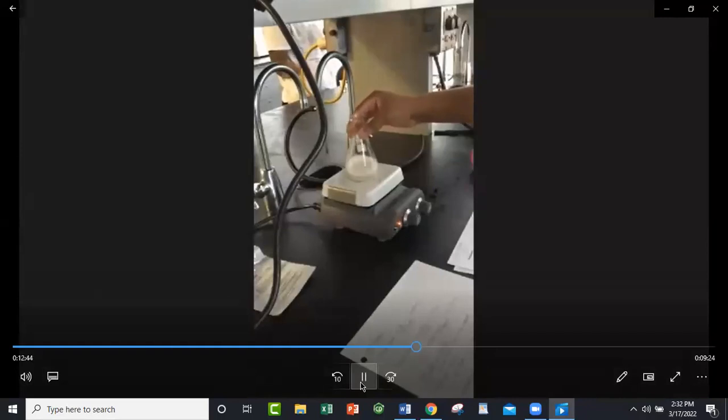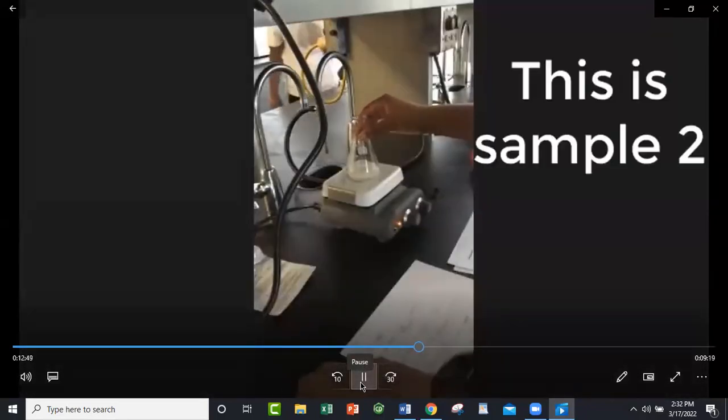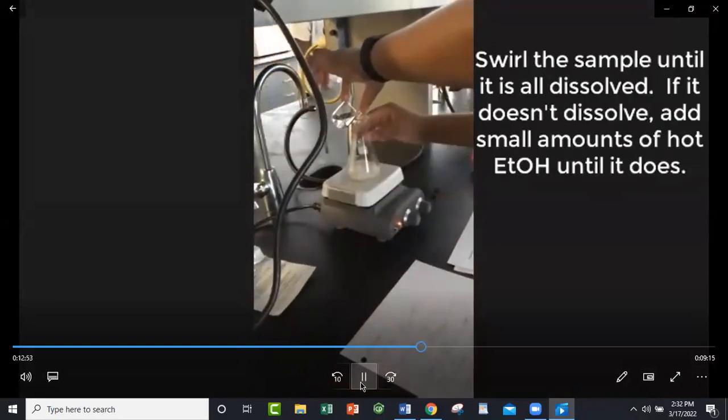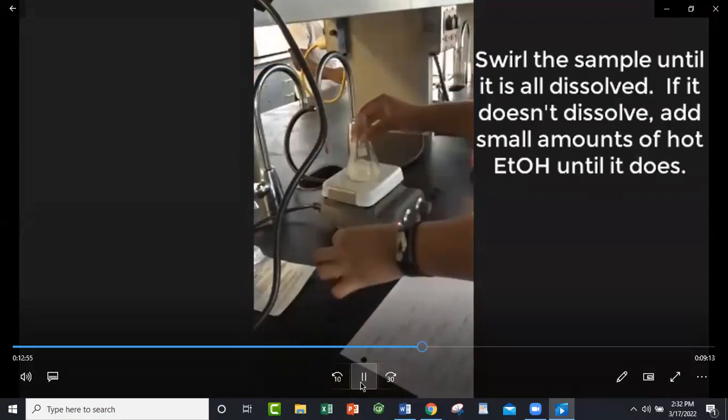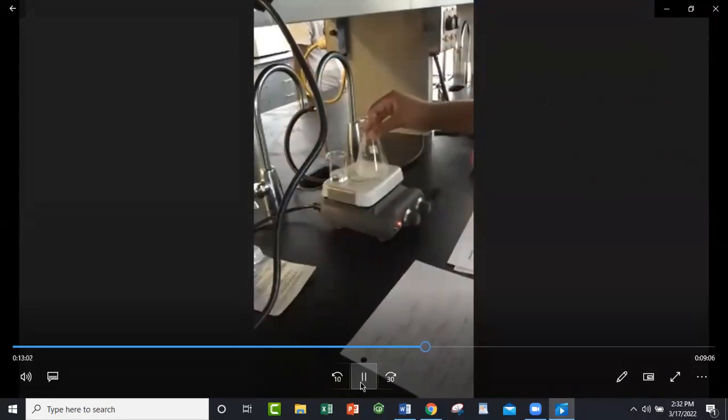Should I add some more? Yeah, you can add more. If it doesn't go in while you're heating it, you can just add more ethanol. And you can set that ethanol in that back corner to keep it hot. Just don't knock it off. Good. Hold on, we got ice.